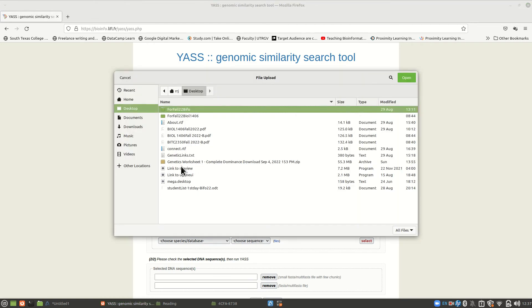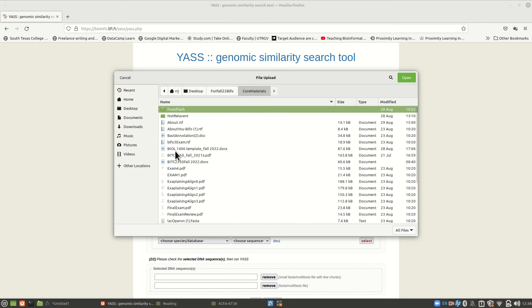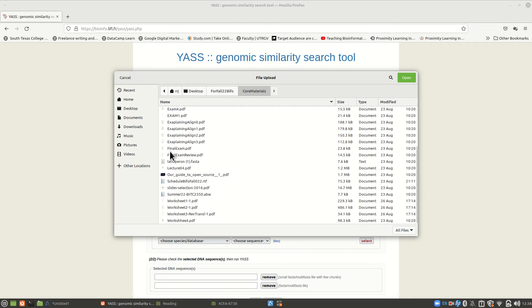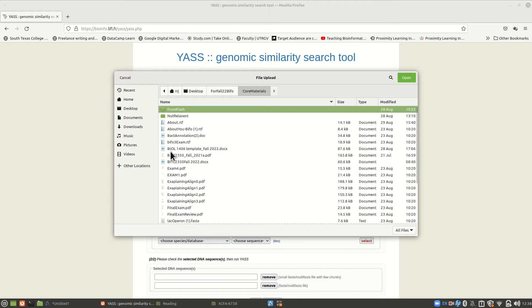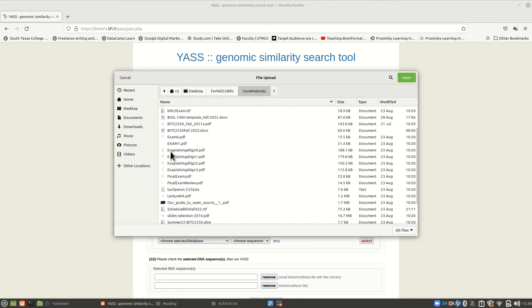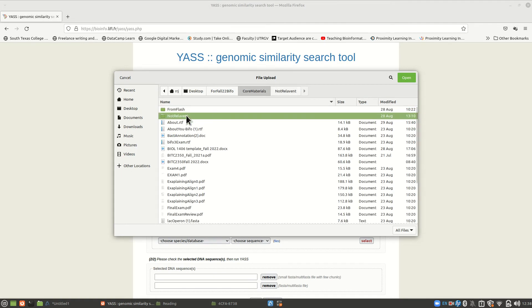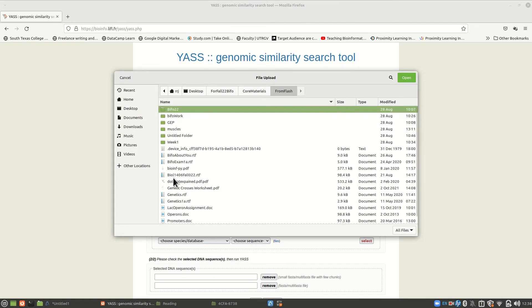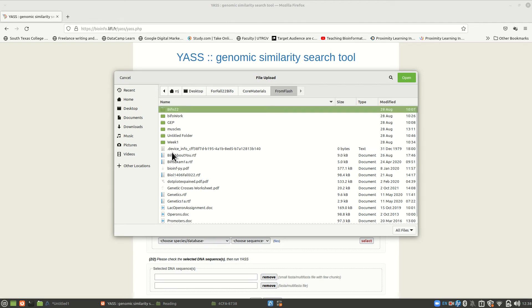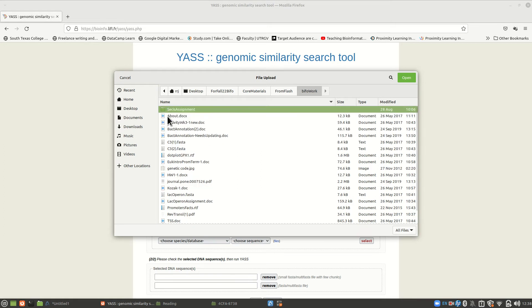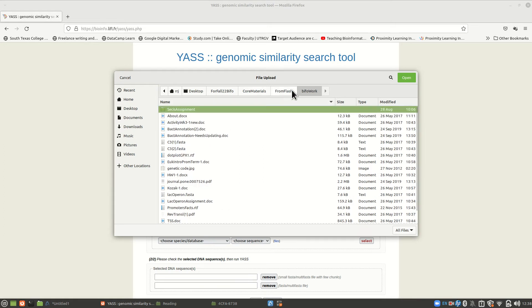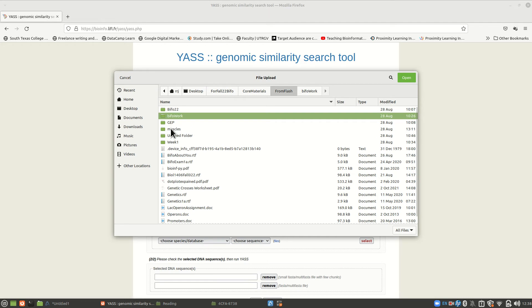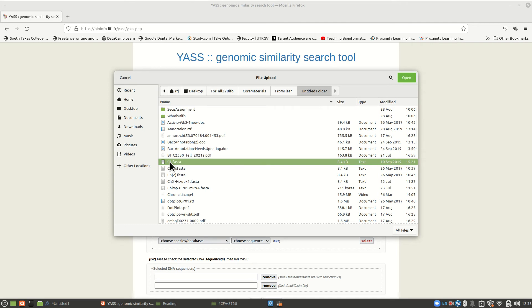So we have FASTA files. Let's browse and find our FASTA files. Let's see. Where did we put them? Oh, I'm on a different machine now. But I can find some FASTA files here. Let's find a FASTA.